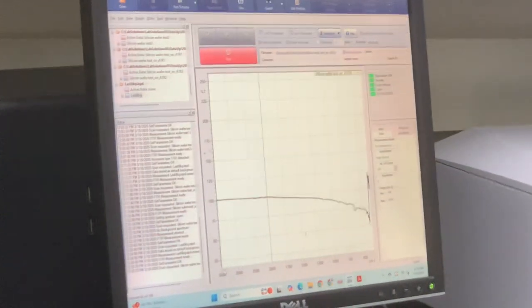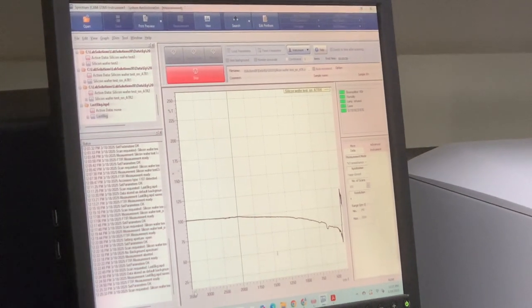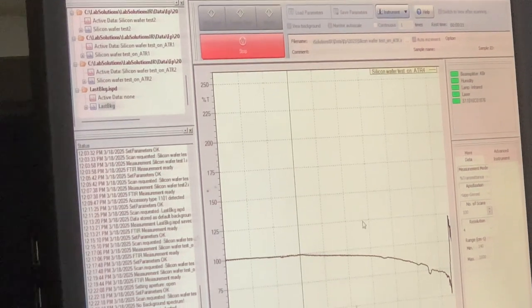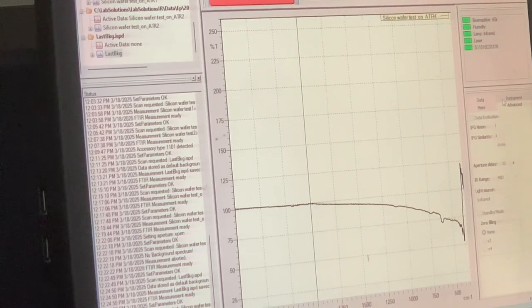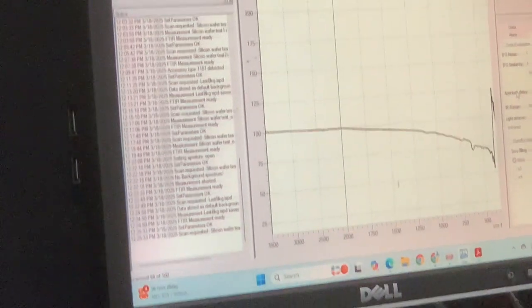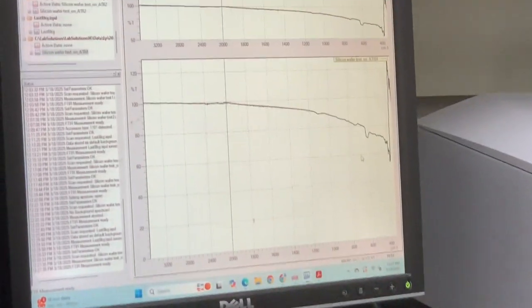I wanted to do it at 4 and then drop it down to 0.25, just so we can see the differences in the resolution. The only tabs we haven't looked at are this More tab and this Advanced tab. The interferogram, thank you. That's what the IFG is. You really can't edit much in those tabs anyway.